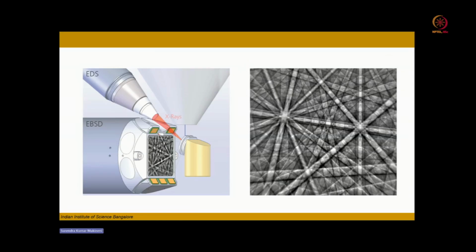So here I'm just briefly going through EBSD. What is EBSD? This is electron backscattered diffraction. The principle is that the sample is tilted at an angle, usually 70 degrees relative to the sample stage, but 110 degrees to the BSC detector. This sample tilting is only to elongate the sample volume.